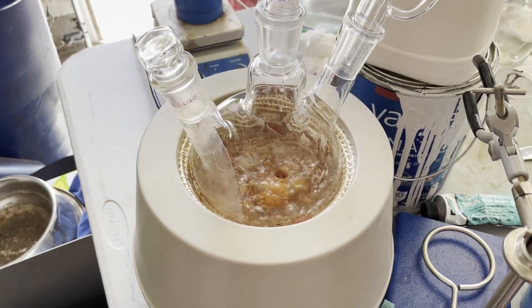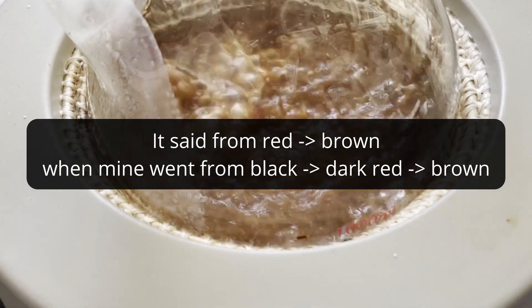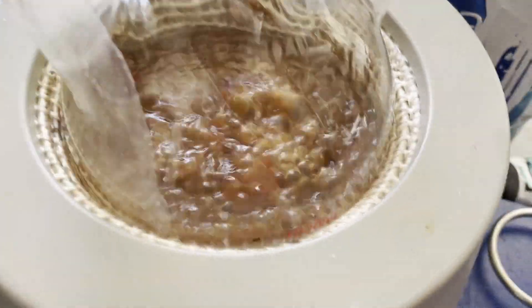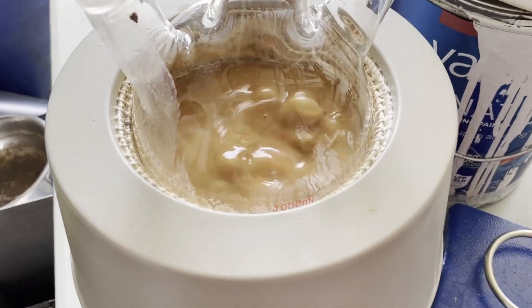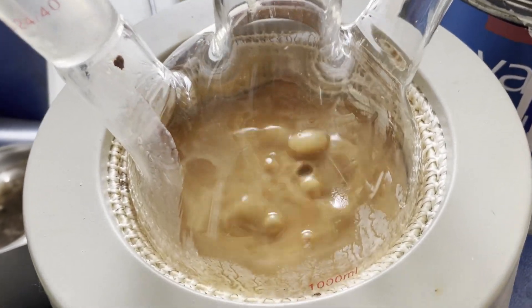The paper says that your reaction is supposed to turn brown, which is good because mine did turn brown. However, the paper's reaction started out clear while mine started out black, so I wasn't 100% sure at this point. However, as time went on, the solution got very, very thick, which is also what the paper said would occur, so I started to gain more confidence that this was actually working.